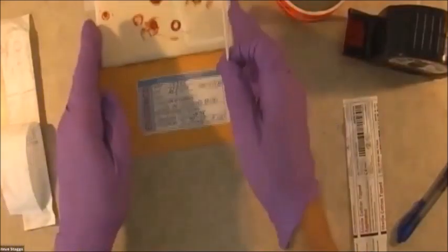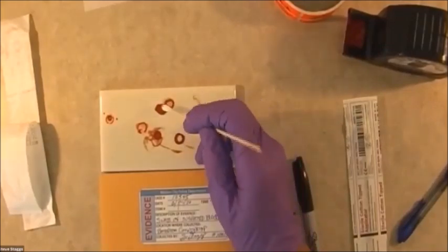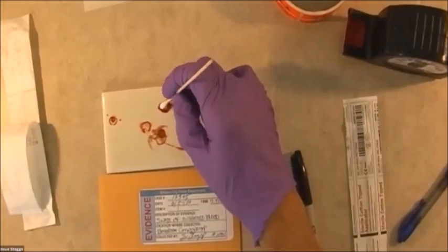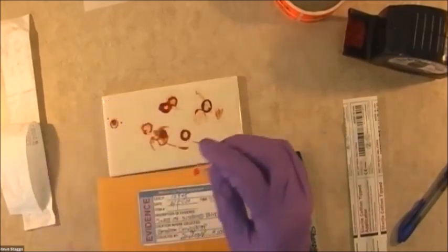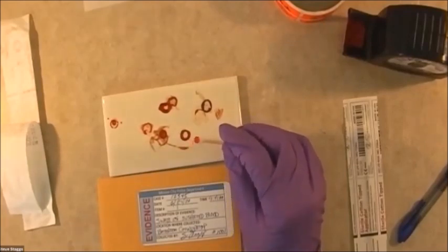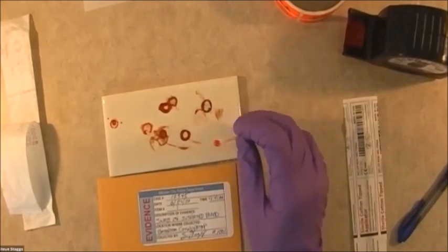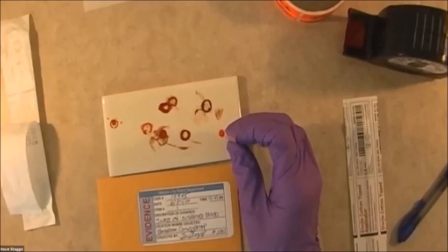So now I can do my sample. I'm going to take this and just rub it firmly — the tip — rotate it. And that is plenty. In the old days, doing simple blood typing before DNA, you would have to get large samples. Now with DNA being so sensitive, you don't need a whole lot. So just make the end of your swab red like that.